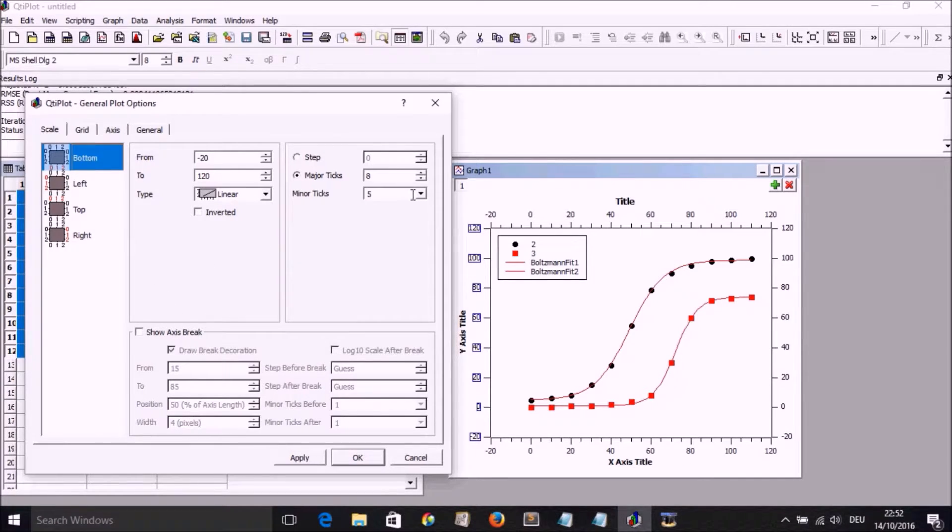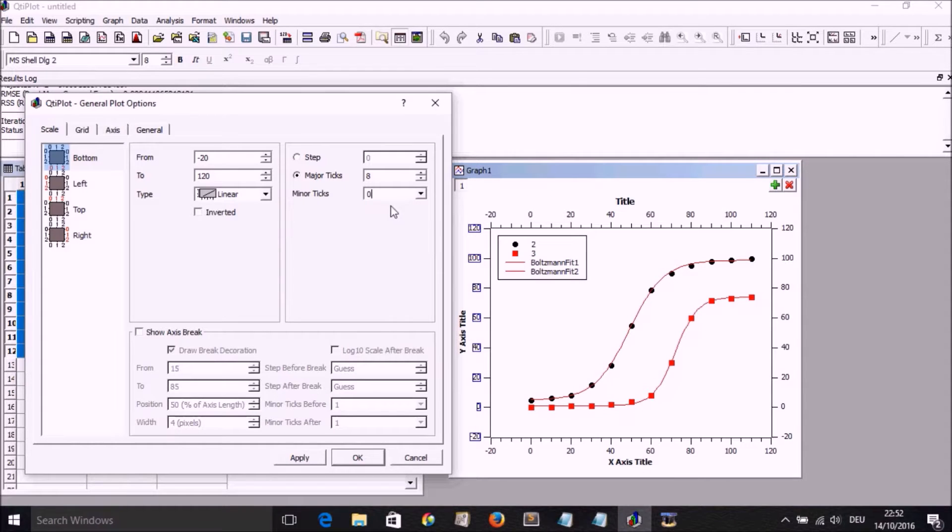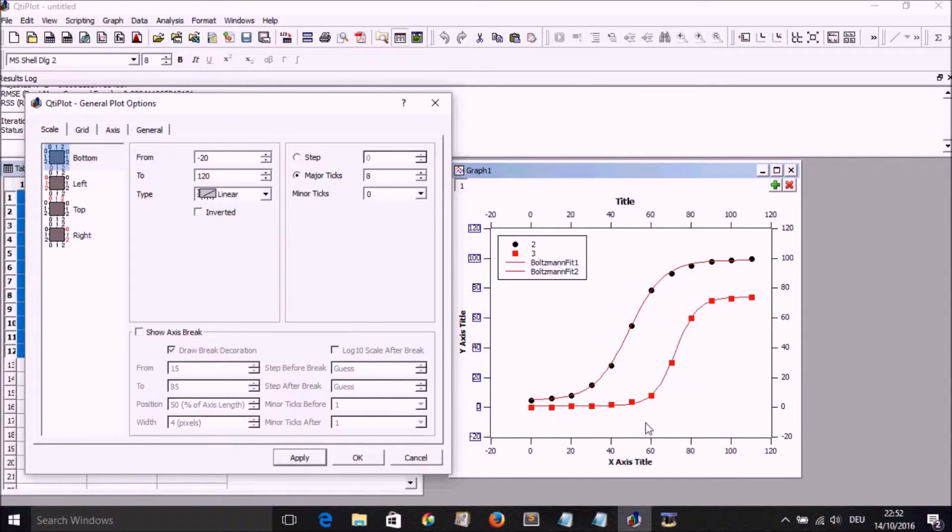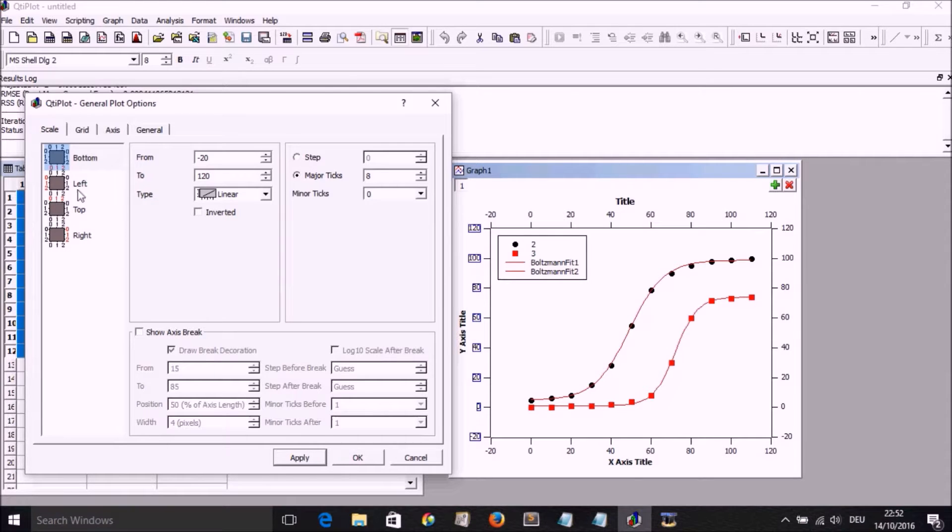So we select the next one, which is the X, adjust the minor and major ticks.